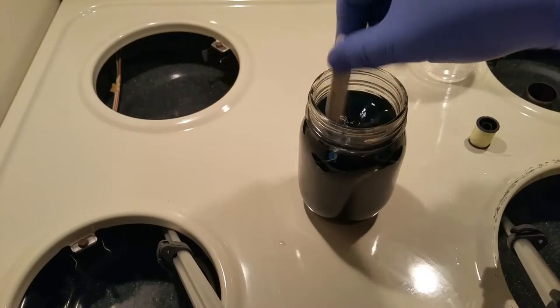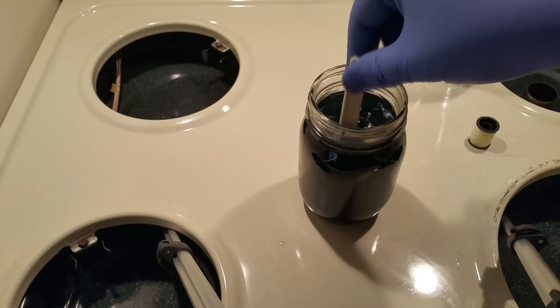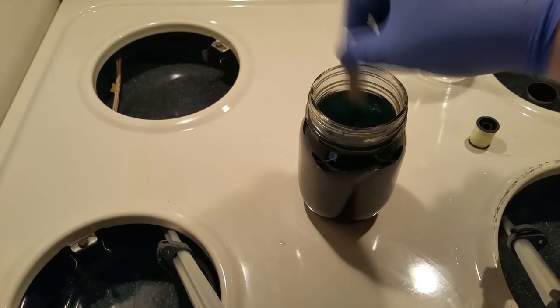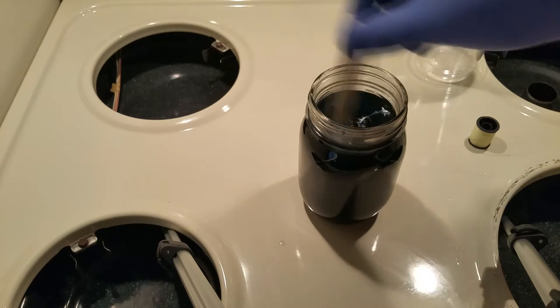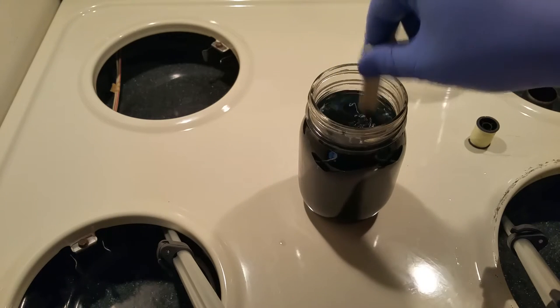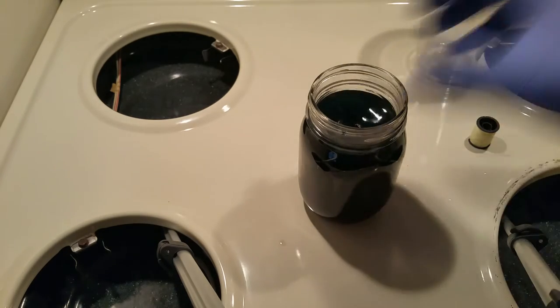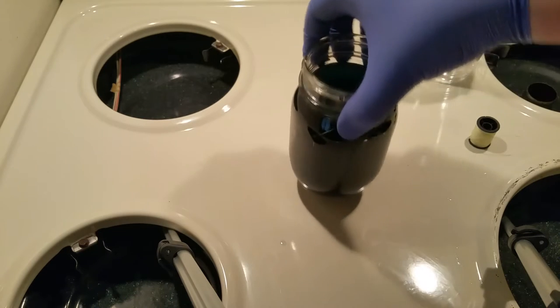First we will need to weigh out a hundred grams of alum and then we will need to add 12 grams of chromium alum into this. This will actually give the crystals a little bit of a purple color, but not too dark.